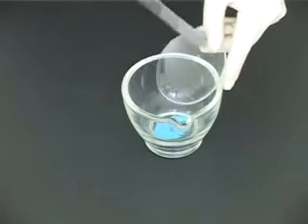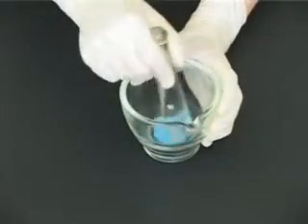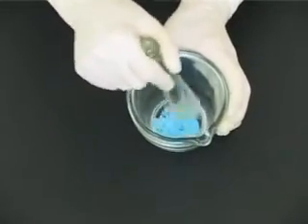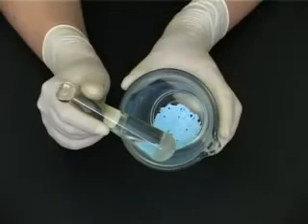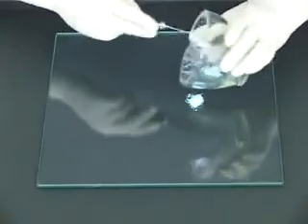Grind the powder well using a glass pestle. This will reduce particle size until a fine powder is formed. This is very important in order to produce an elegant and effective product. Transfer the powder to a clean glass tile using a spatula.